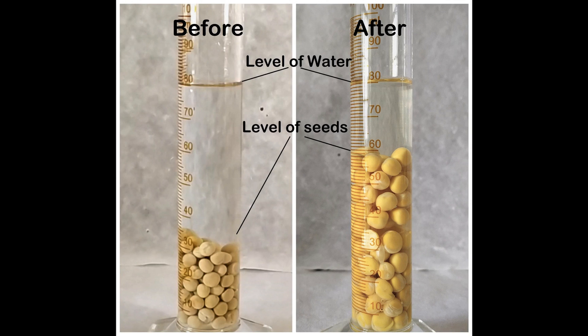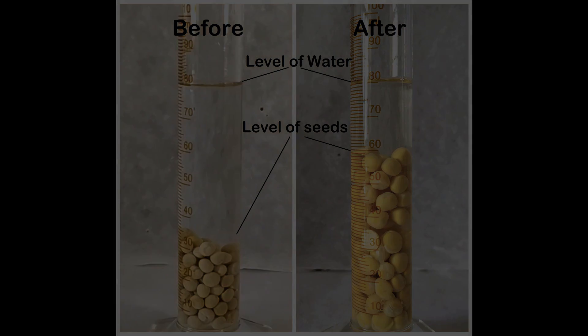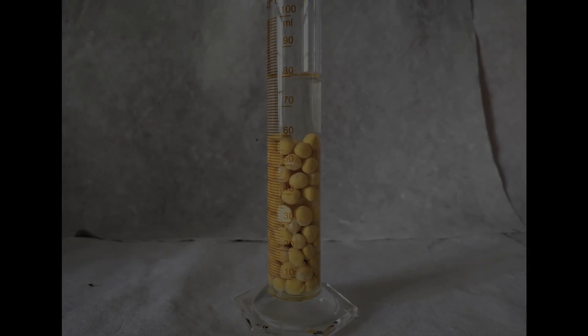This shows that the dry seeds began absorbing the water in the cylinder to eventually increase in size and volume. However much water has been absorbed by the seeds is reflected by corresponding decrease in the volume of water in the cylinder and vice versa. This simple experiment demonstrates the phenomenon of imbibition in seeds.